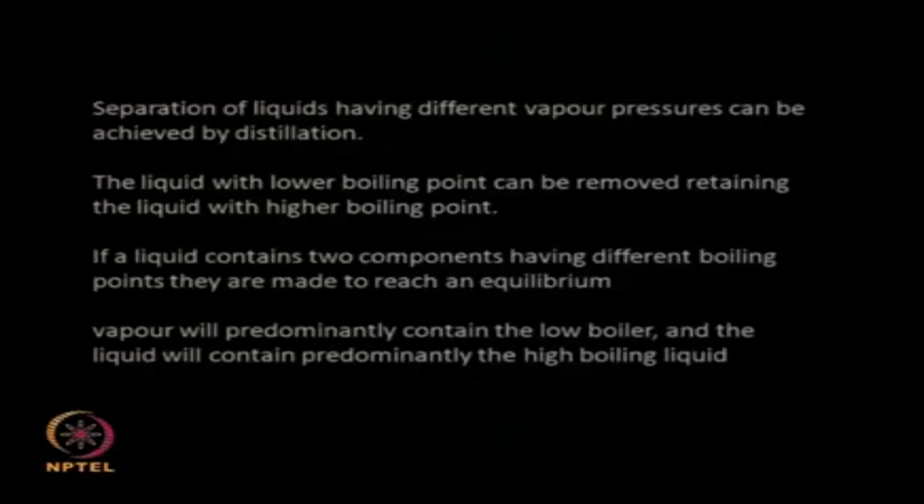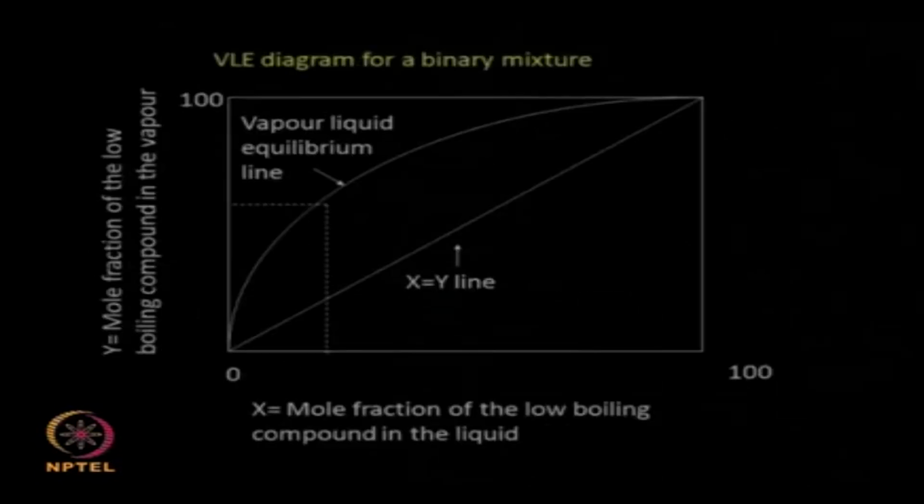I can once again take that mixture, heat it up, condense the vapor, and have more methanol, and so on. That is how I can recover all the methanol. This type of distillation is very useful if you are working on recovery of solvent from extraction, recovery of solvent from chromatography, HPLCs and so on.